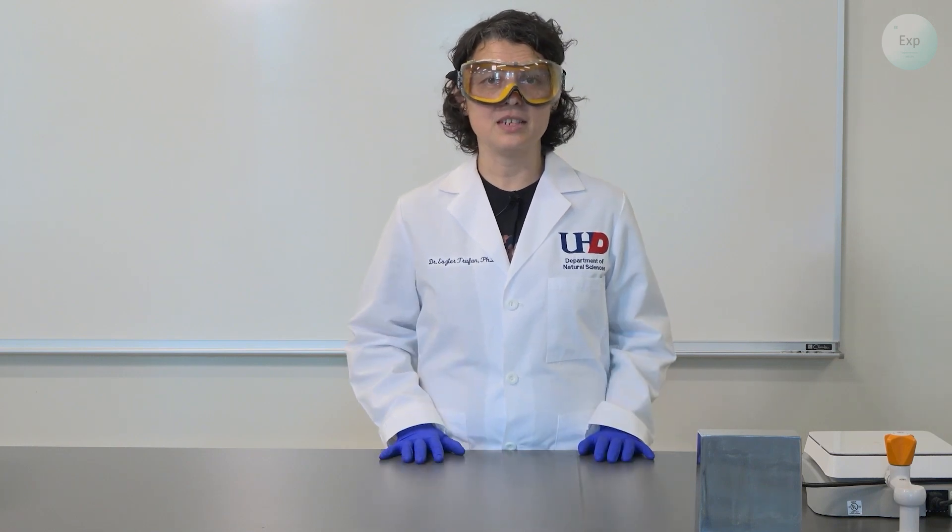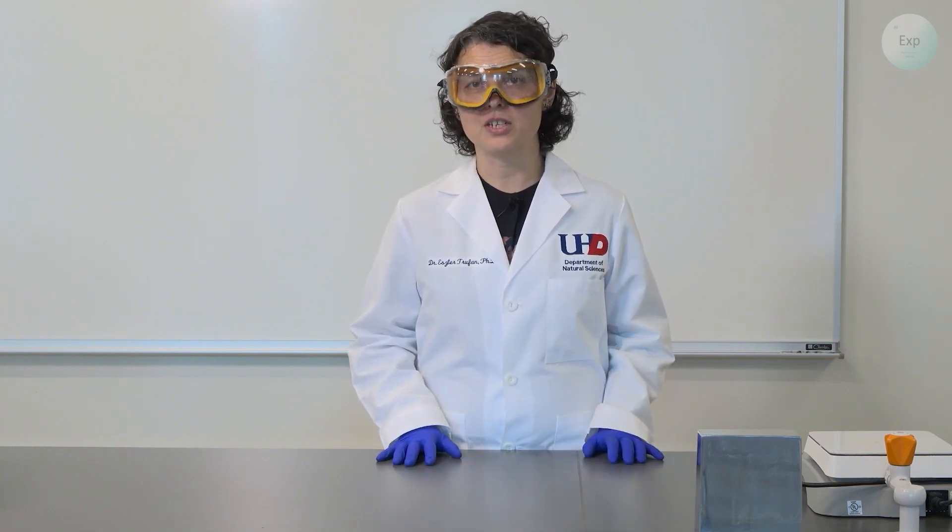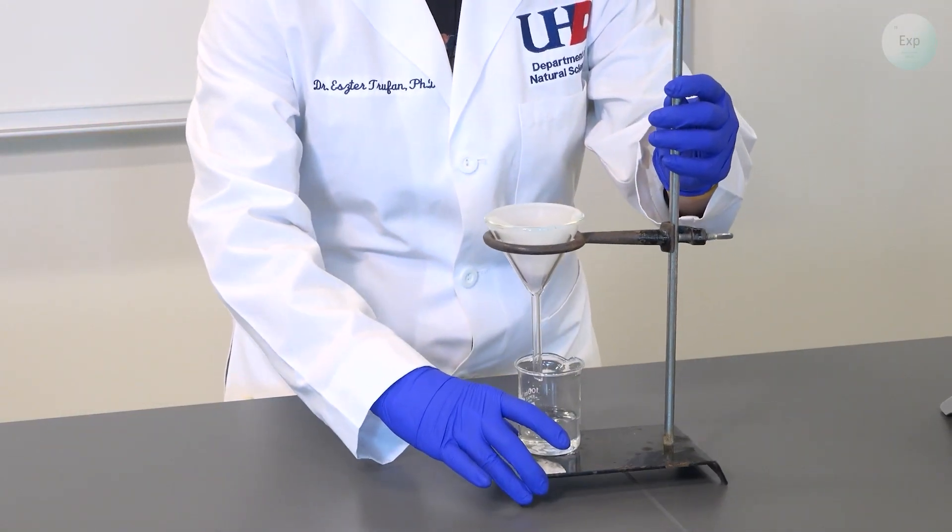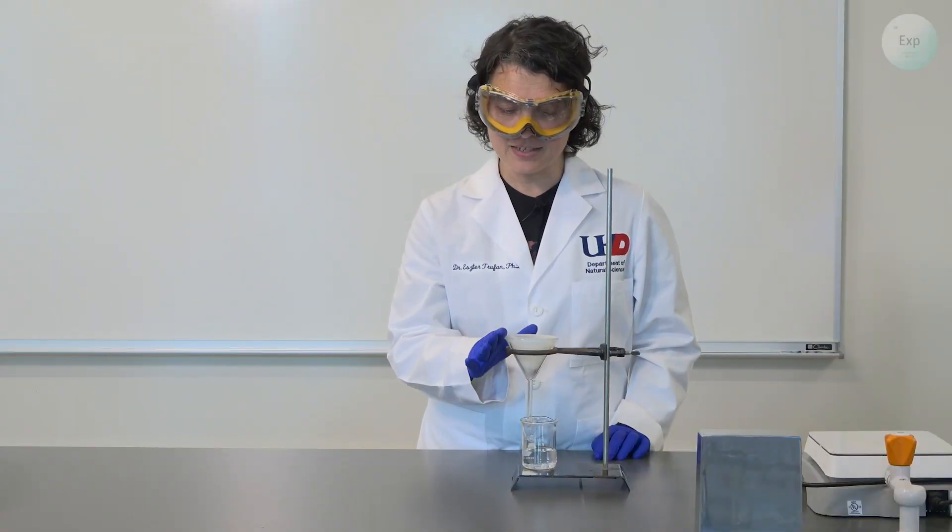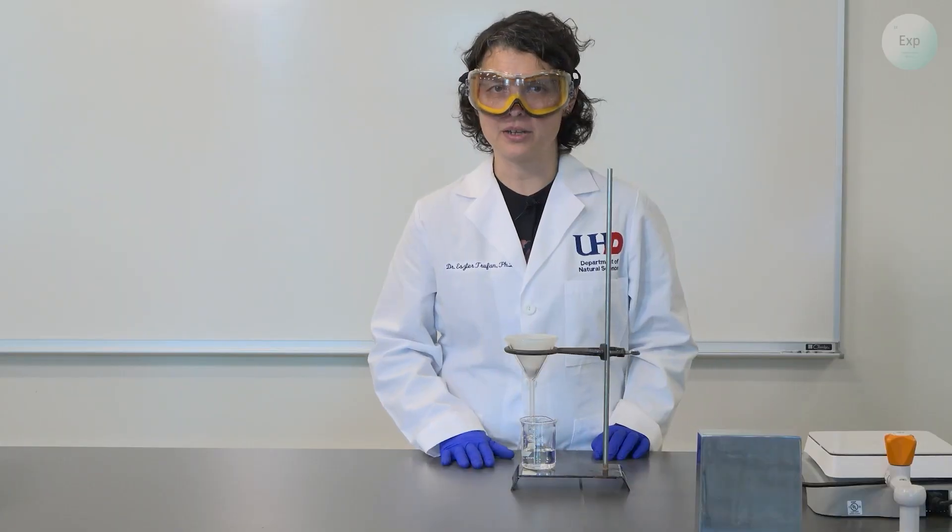So the first thing I'm going to need is the result of my filtration setup. Here I have the sand on the wet filter paper still inside the funnel, and here I have the salt dissolved in water.